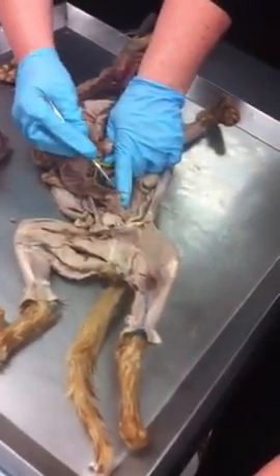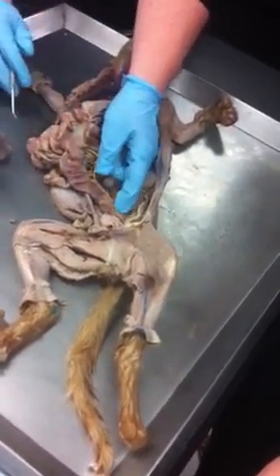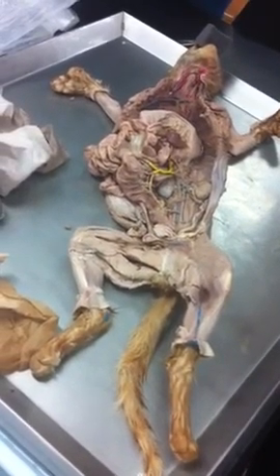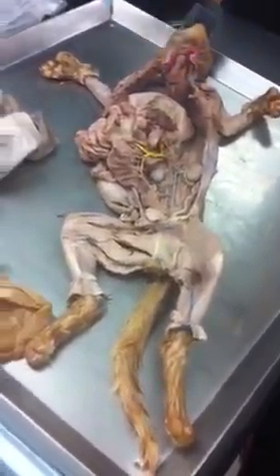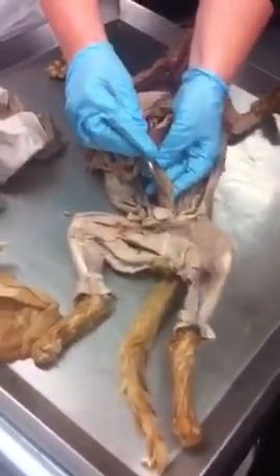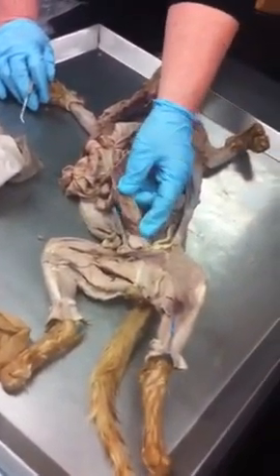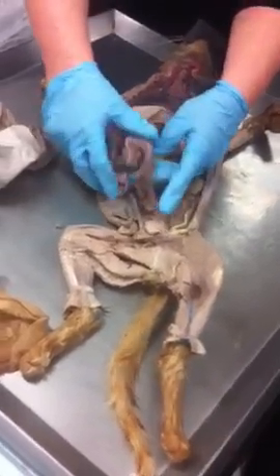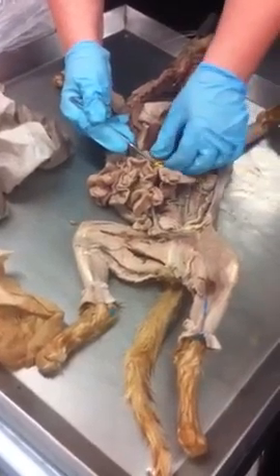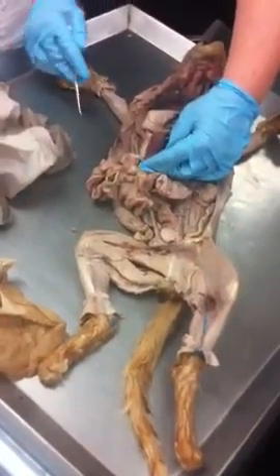That one is the easy one, the inferior mesenteric artery. It's just going to be traveling along the colon, and as it goes down this way, it's going to the sigmoid, which on the human is the S-shaped portion. This yellow one that's traveling right next to the inferior mesenteric artery is the inferior mesenteric vein, so that's the easy one there. As we go farther up, it's going to join together with the superior mesenteric.